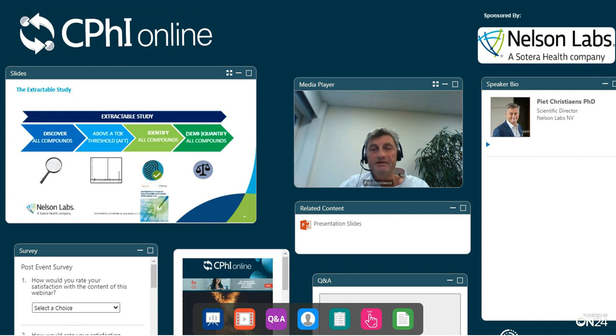because it's only then that you can link the identity of the compound to its relevant toxicological information. We at Nelson Labs have published an ebook on good identification practices, and it explains the steps that we take in trying to identify compounds, whether they are extractable or leachable compounds. If you would be interested, you can download that from our website. And in the next step, we try to quantify those compounds, because it's not only the toxicity, but it's also the quantity of those compounds in the material that will play a role in terms of making that initial safety assessment.